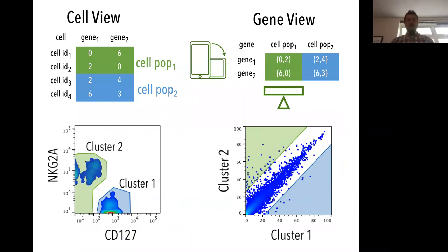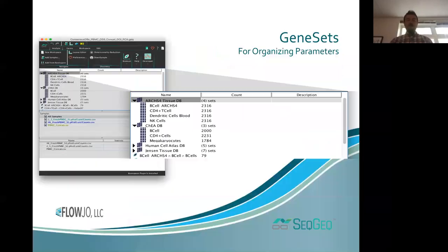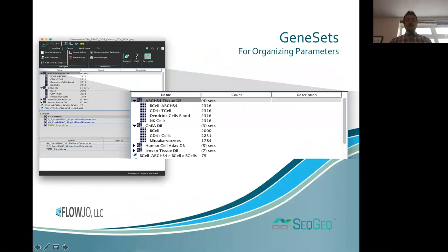This can be a little confusing, especially for first-time users, so feel free to reach out if you have questions about how this works. The gene sets you create by gating in the gene view are available at the top of the workspace. There's a variety of different gene sets which can be imported and exported using SeatGeek.